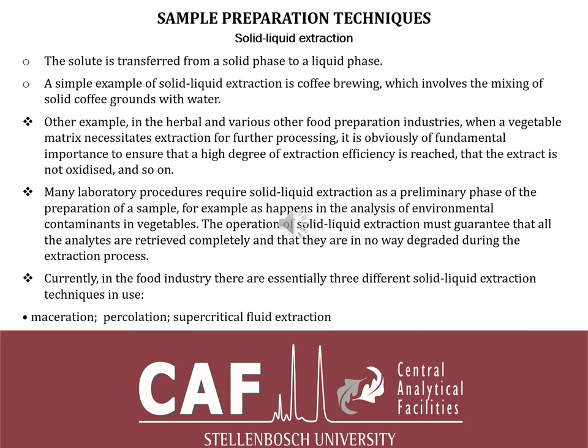Currently in the field, there are essentially three different solid liquid extraction techniques: maceration, percolation, and supercritical fluid extraction, which we will go further into. This was just to introduce you to some extraction techniques.